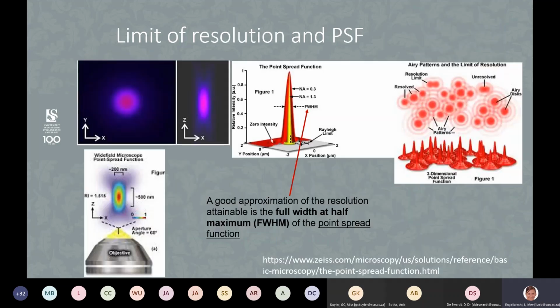Just get next. Right. So this point spread function, what it is, etc. It's basically, you would have a fluorophore right in the middle of the circle, but you won't ever be able to see that with normal light. Maybe with an electron microscope if you know what you're looking for.